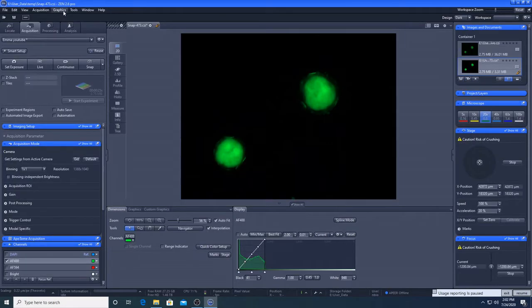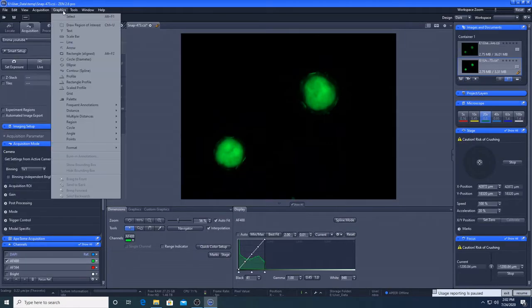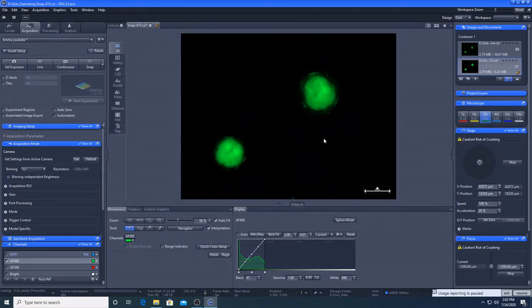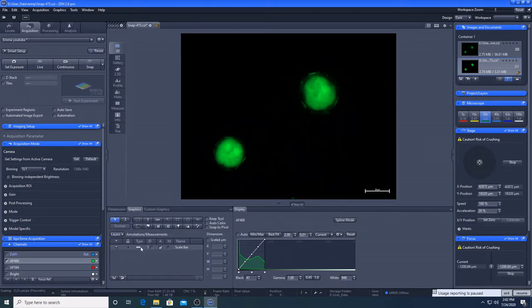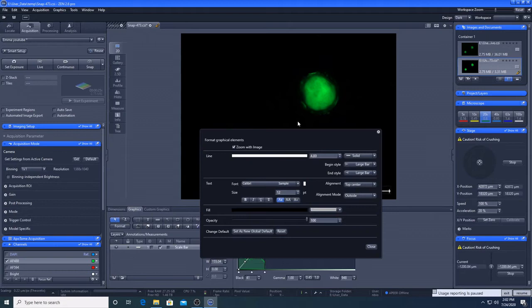To add a scale bar, we can go to graphics, and go to scale bar. This can be customized using this window. For example, the weight of the line can be changed here, and the text size can be changed here.